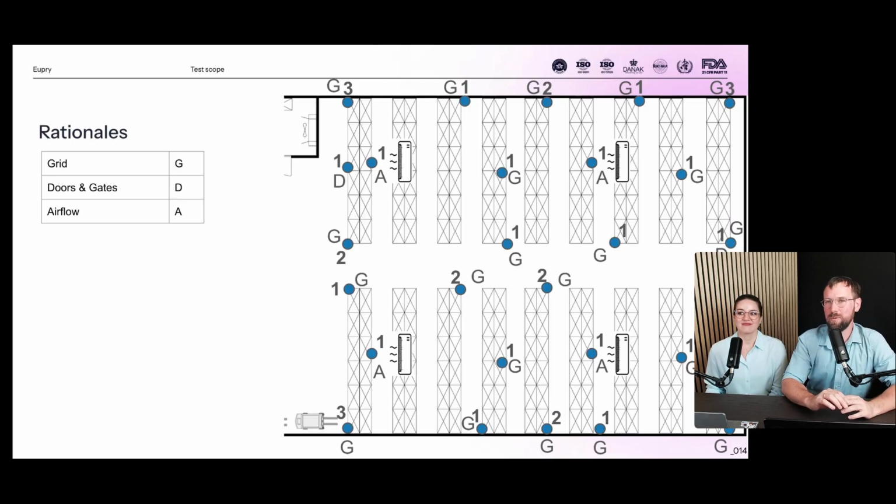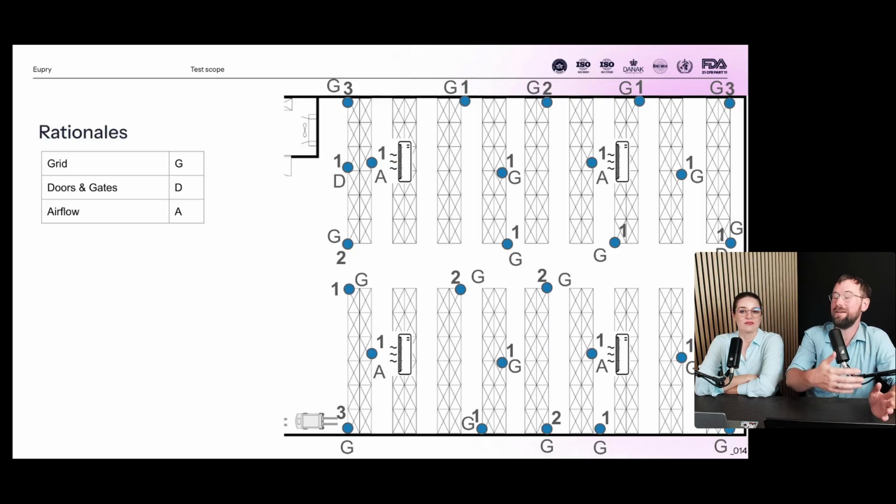As I mentioned before, we don't have unlimited time. We could talk for hours, I think, on just this topic. But in general, you should have as much data in order to be able to verify that the test method was appropriate for the testing methodology that you actually chose. So when writing the protocol, you're also communicating what kind of design do we see, and what would be a good test methodology in order to mitigate the risks related to this as well.